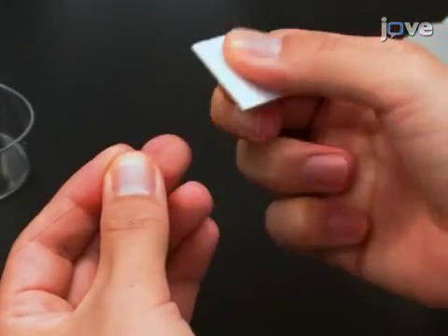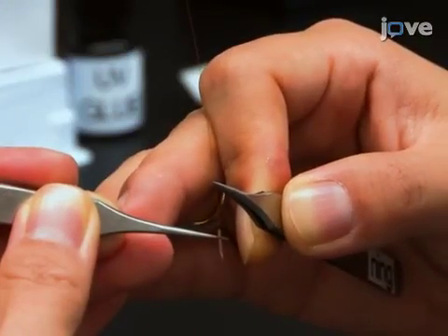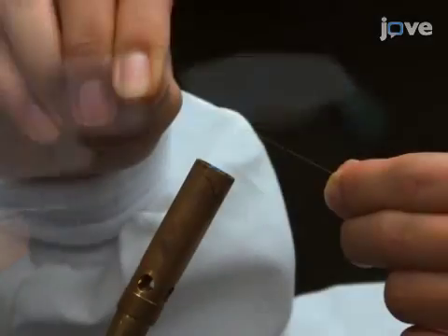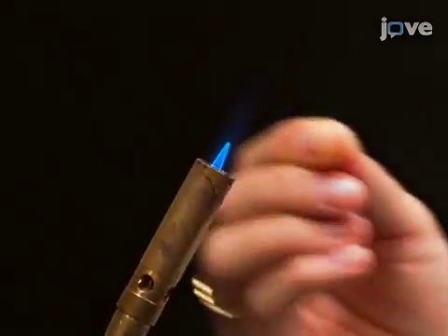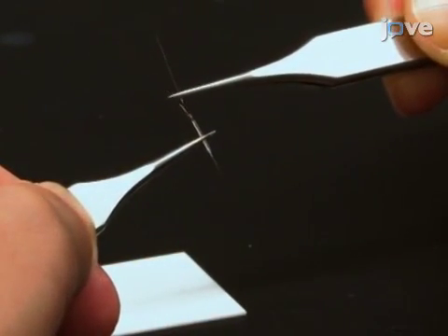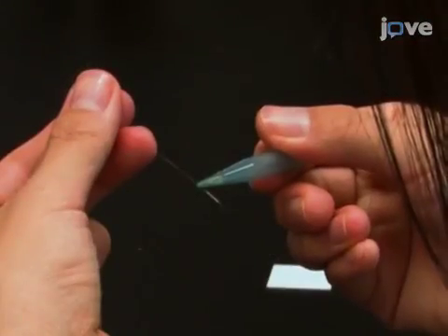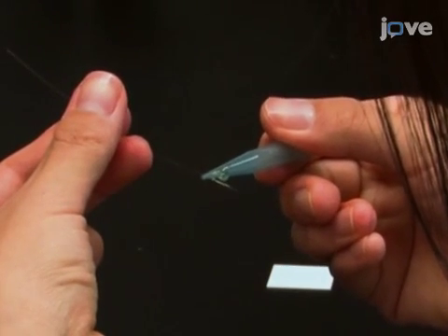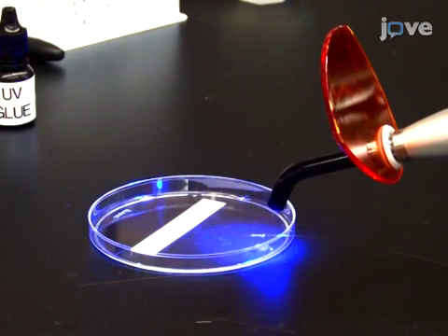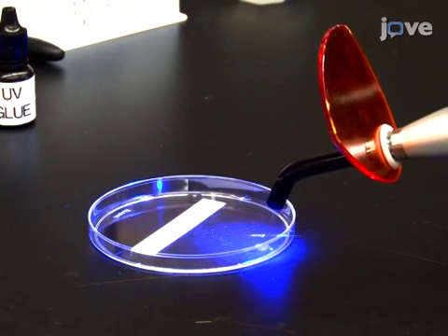Cut an 80-millimeter section of fused silica capillary as the solvent providing capillary. Then insert the capillary into one bore at the flat end of the dual-bore quartz needle. Using the flame to pull a fused silica capillary as a nano-ESI emitter, cut to 7 to 10 millimeters long and insert it into the other bore at the flat end of the dual-bore quartz needle. Apply a minimal amount of UV-curing resin onto the flat end and solidify using an LED UV lamp for approximately 20 seconds to secure the solvent providing capillary and the nano-ESI emitter.